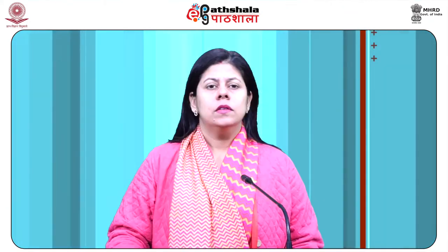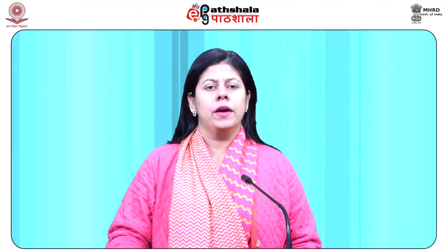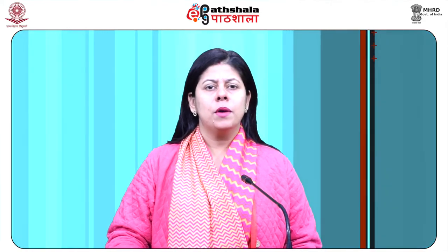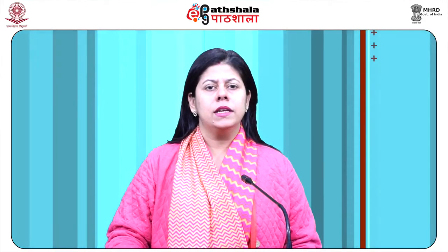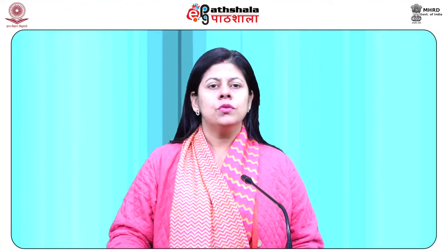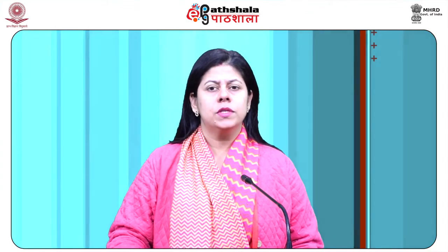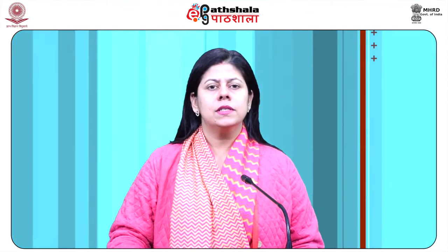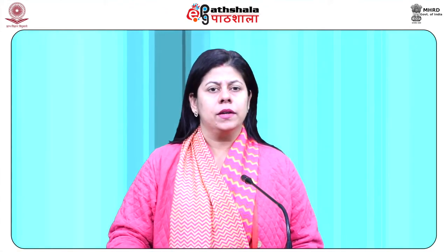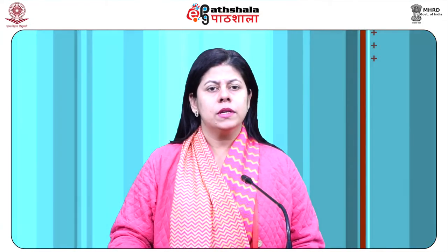Stereo microscope. The stereo or dissecting microscope is an optical microscope variant designed for low magnification observation of a sample using incident light illumination rather than transillumination. It uses two different optical paths with two eyepieces and two objectives in order to deliver slightly separate viewing angles to the left and the right eyes. A three-dimensional image of the sample is produced in this way.